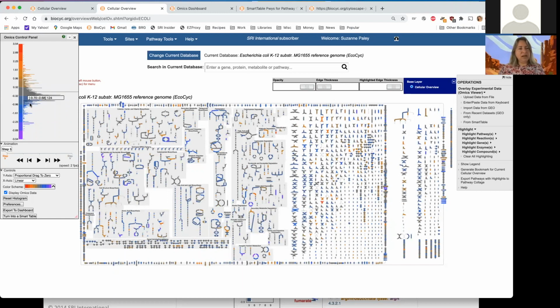So, most of the data falls in the central region here, but it's really the outliers that I'm likely to be interested in. But if I play this, I can sort of see how things change here. But it's kind of hard to see, that's a lot to visually keep track of. So I can actually change things in various ways. For example, I can customize my color scheme.